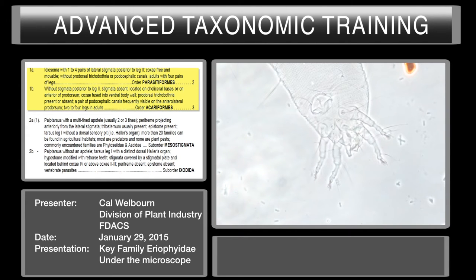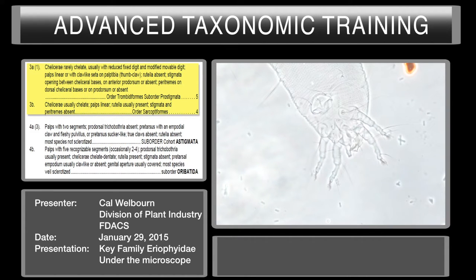So we're going to move down to couplet three. Chelicera rarely chelate, usually reduced fixed digit, modified movable digit, palps linear or with claw-like seta on palp tibia. Rutella absent, stigmata opening between cheliceral bases, anterior prodorsum or absent. Paratremes on dorsal cheliceral bases on prodorsum or absent. So we're going to look to see if we have any stigmata paratremes, and we're going to look at the chelicera and the palps.